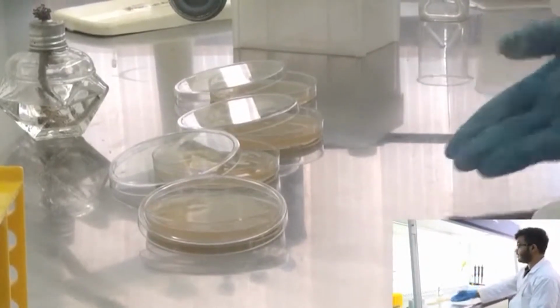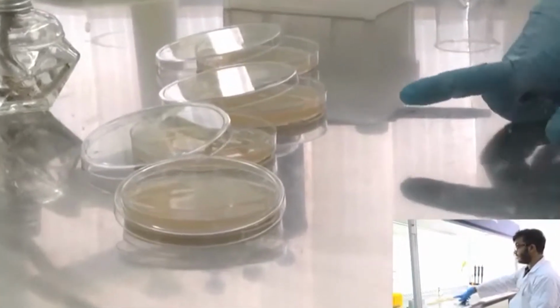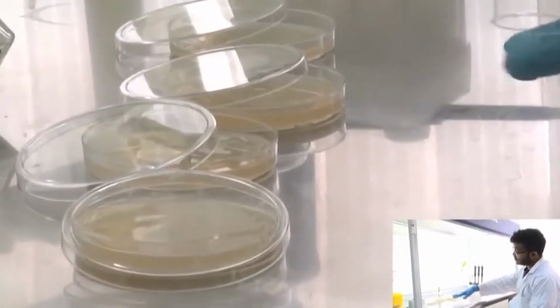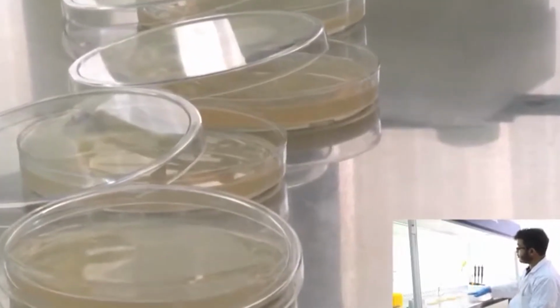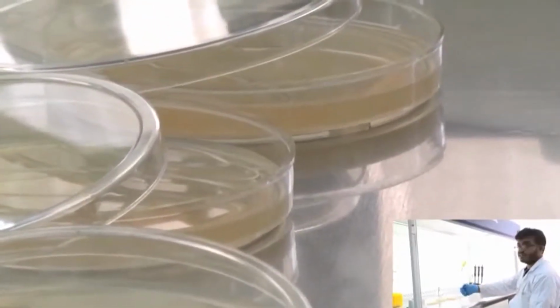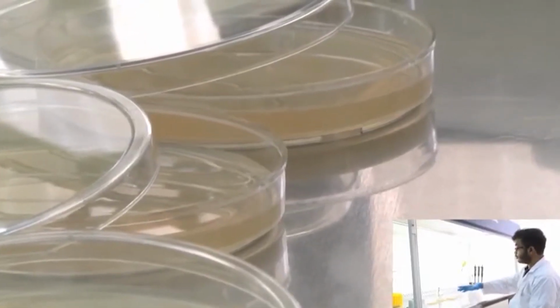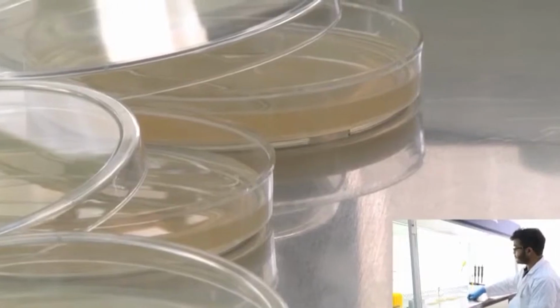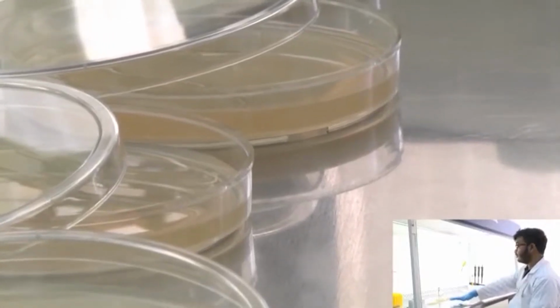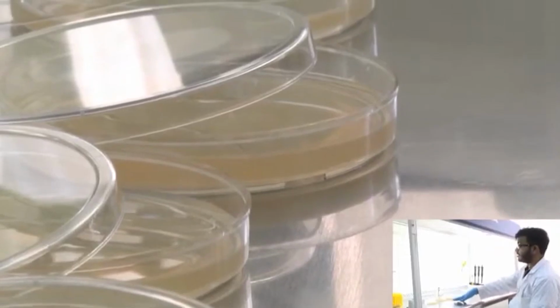The color slightly changes and it becomes more wheatish in nature. I don't know if you can see it or if you can appreciate the color change, but while working in the lab with experience you will be able to notice these differences, and this is a good point to look towards when judging whether the plate has solidified. However, if you leave it for around 20 minutes it will solidify along with the color change.